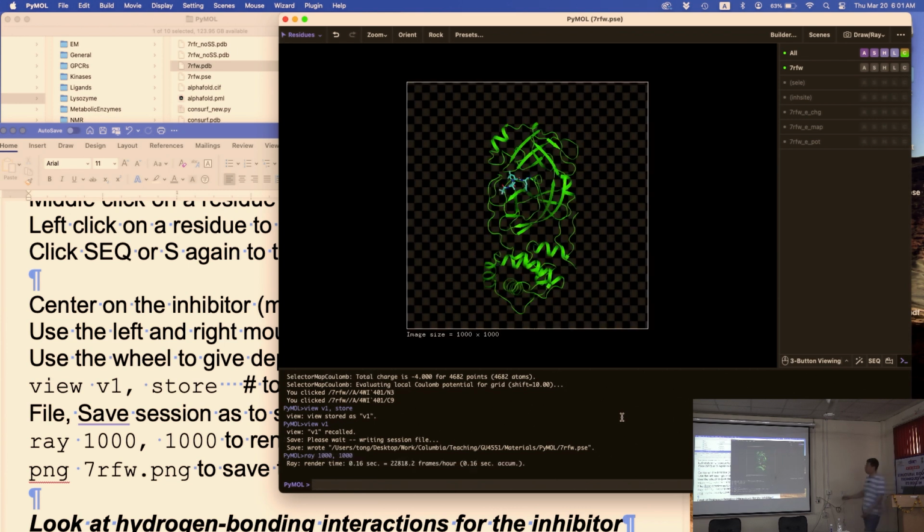So now it made that file. It shows essentially the thing sits in here. If your scale is too big, something may be cut out. You scale down a little bit, and then render again. Do ray tracing again. So leave it like this. Don't touch it. If you touch it, you lost it. You have to do it again.